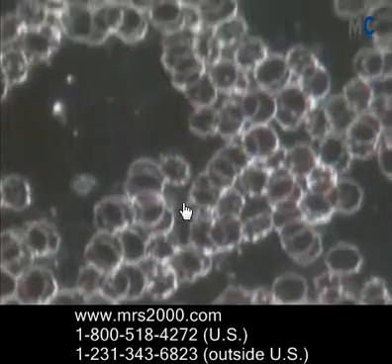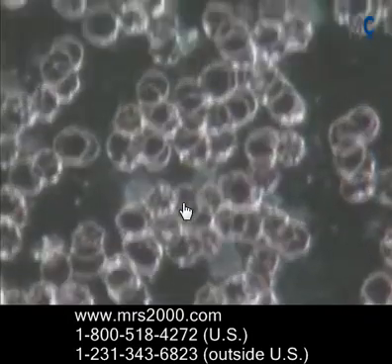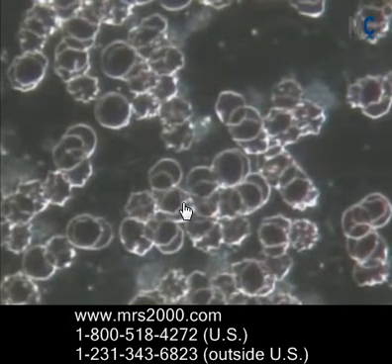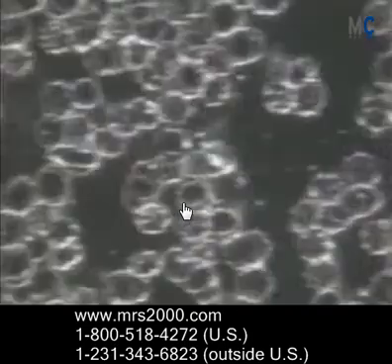Let's take a look at the second example. This person is even worse off than the first one. Notice not only are the blood cells all clumped together, but they're also deformed — they're not perfectly spherical — so again this is going to inhibit the amount of oxygen that can be absorbed and released into the cells.